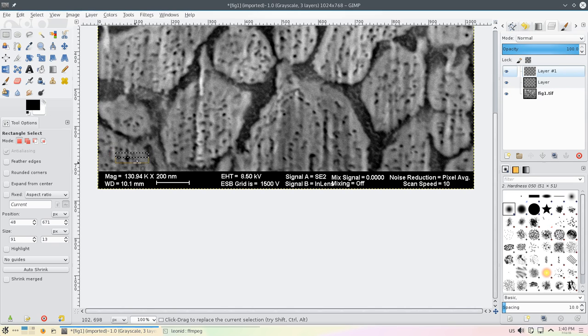And we want to fill this area with white color. Maybe stretch a little bit higher so it will be thicker and more beautiful. And fill it with white color, with the background color. To do that, we do Control dot. Control dot fills with the background color. So now we can see it is white.